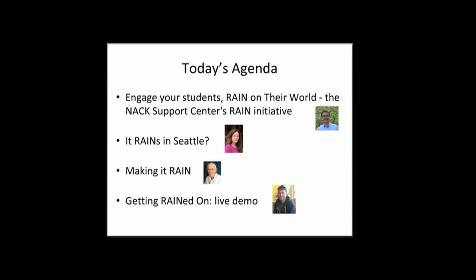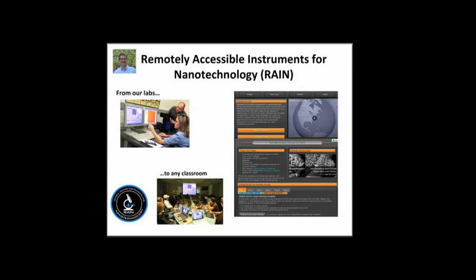They were out of the creative mind of Dr. Michael Lisicki, otherwise known as Mesa Mike. Okay. So what is this remotely accessible instruments for nanotechnology? It's a way to connect. You now have the ability to connect your classroom to equipment in labs across the country via simple distance technology tools. Mike will be talking about the mechanics of this later, and he'll show us how to get there via our website, okay?